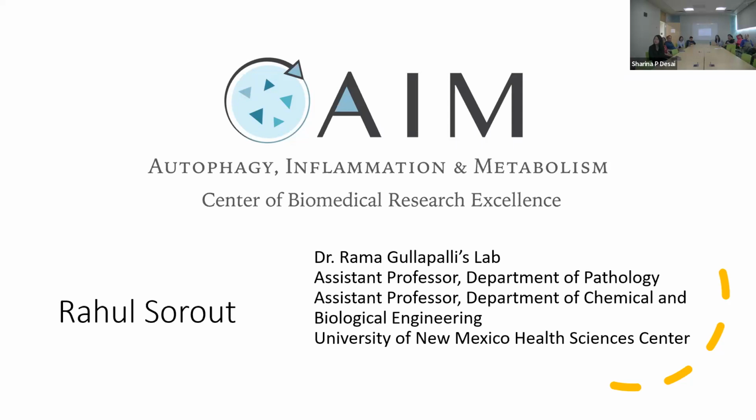Our project in our lab, we are trying to find out the synergistic effect of glucose and cadmium on insulin resistance in hepatocellular carcinoma cells. For that, we chose two cell lines, HepG2 and Huh7, which are very common hepatocellular carcinoma cell lines. And we exposed them for a long period of time, like 6 months, to a low dose of cadmium and glucose, just to check whether heavy metal has some impact on insulin resistance or not.